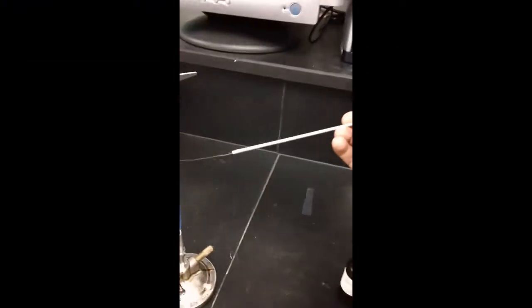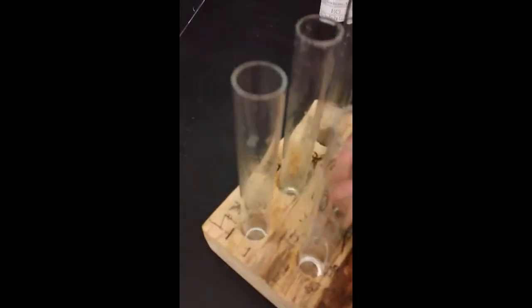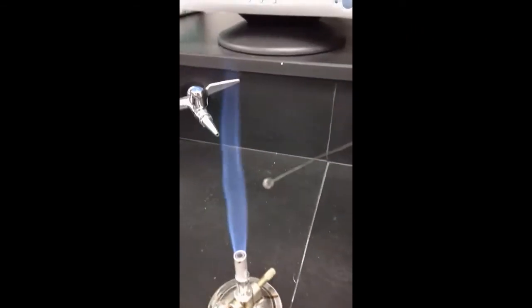I'm going to rinse it real good. Okay, make sure we're burning clear. Now what we're going to do is we're going to switch to our other side, and we're going to be doing CU next. So here you can see CU. Okay, put it down in there. Make sure I have my loop.